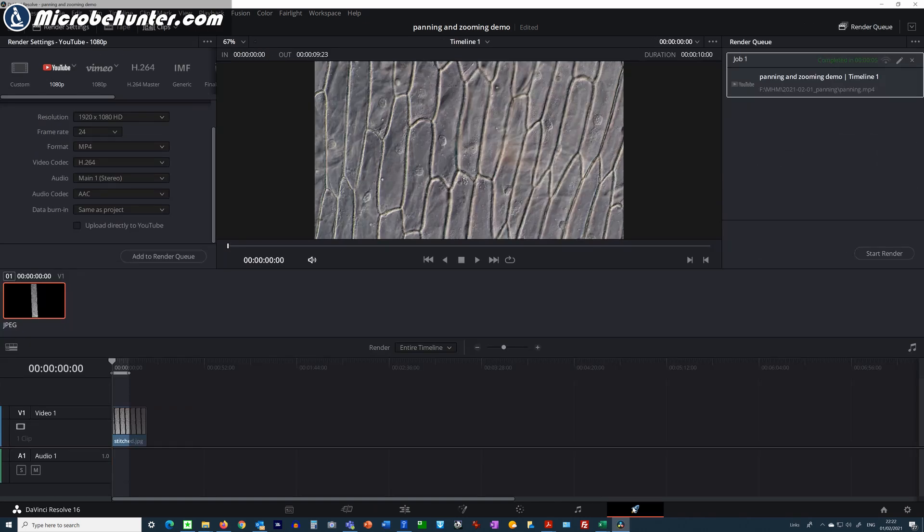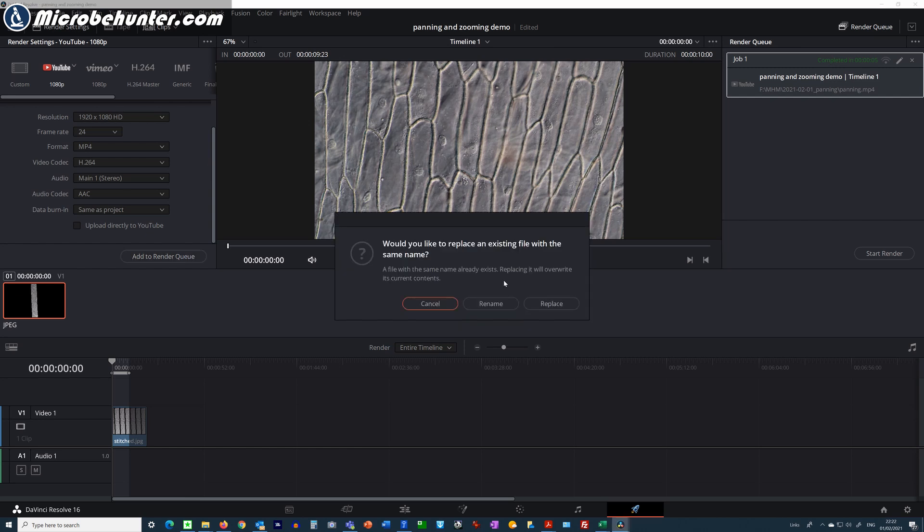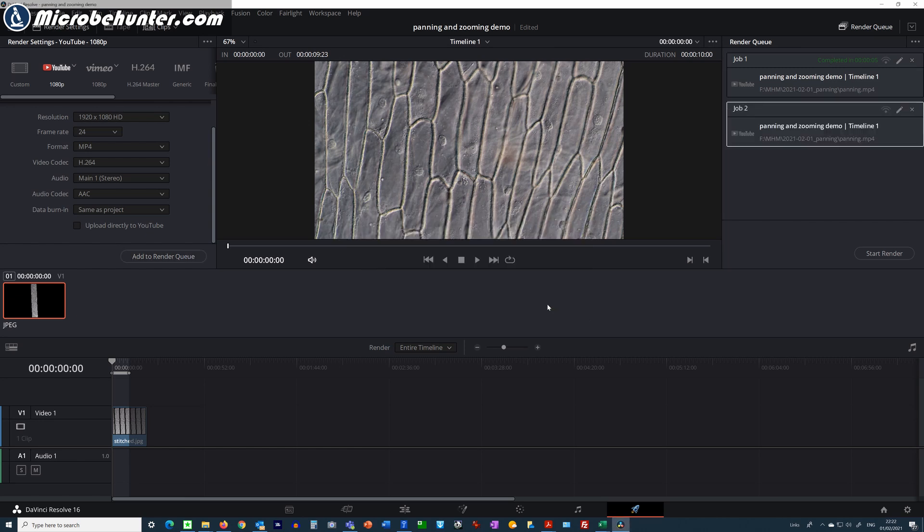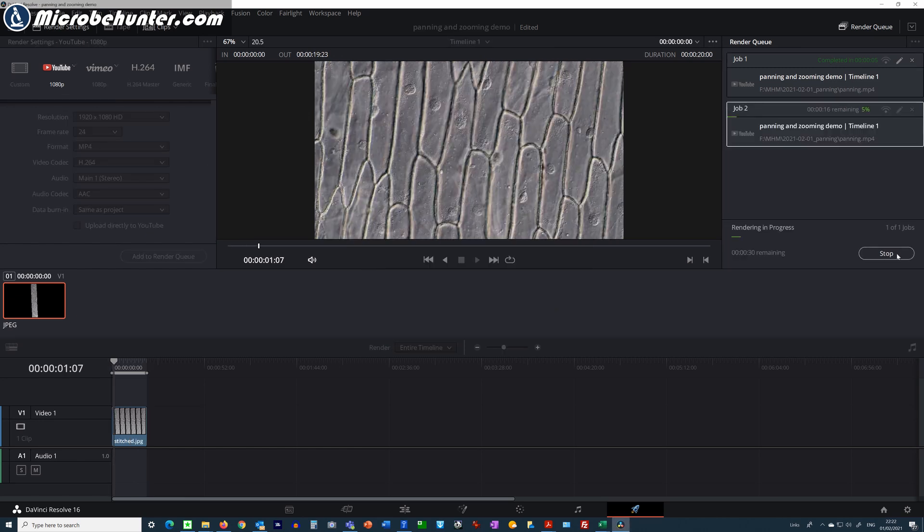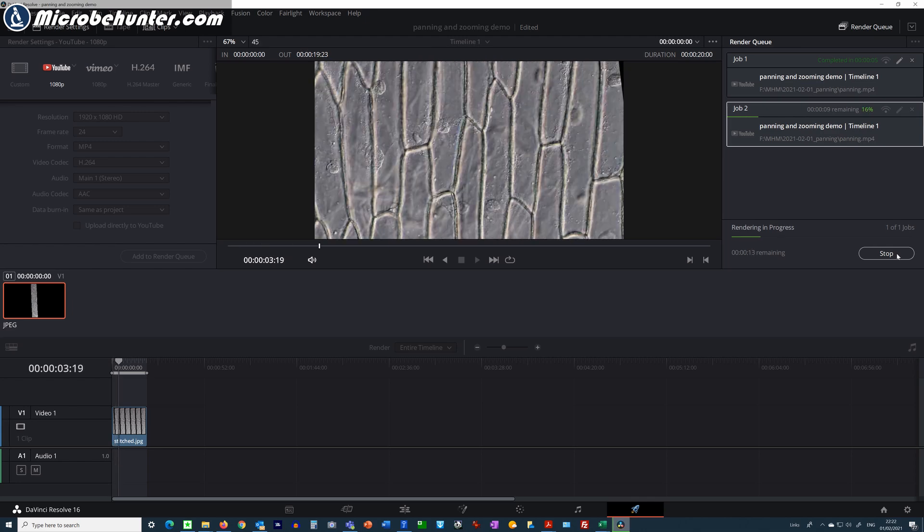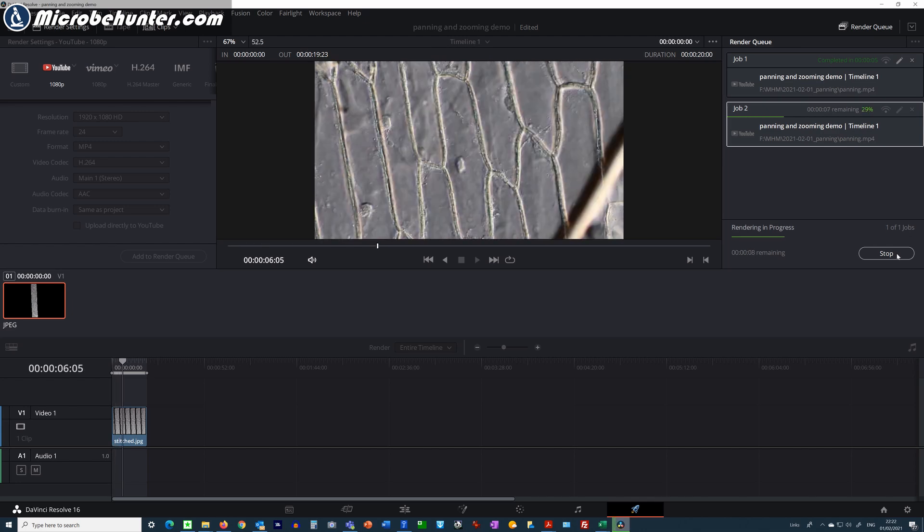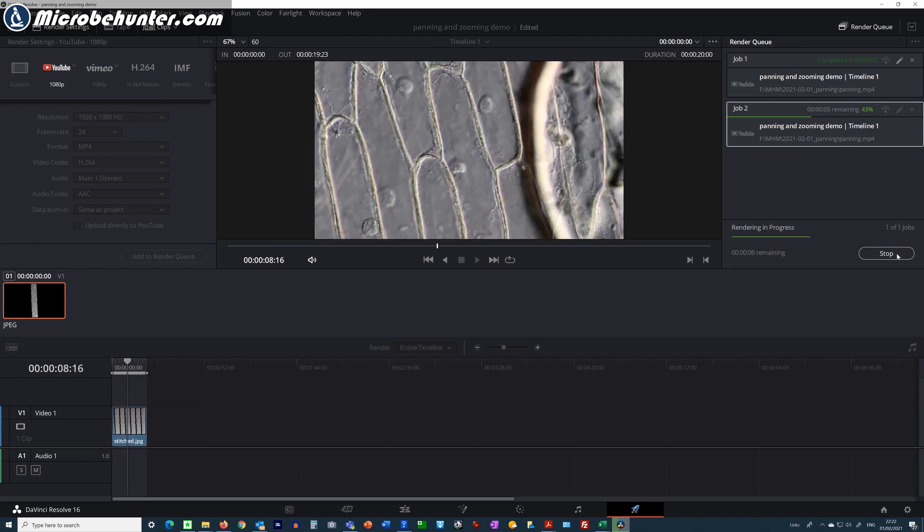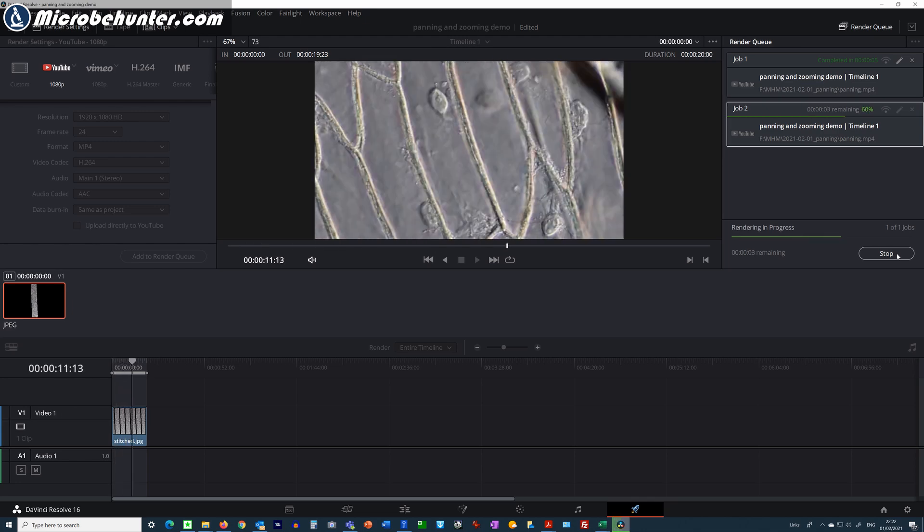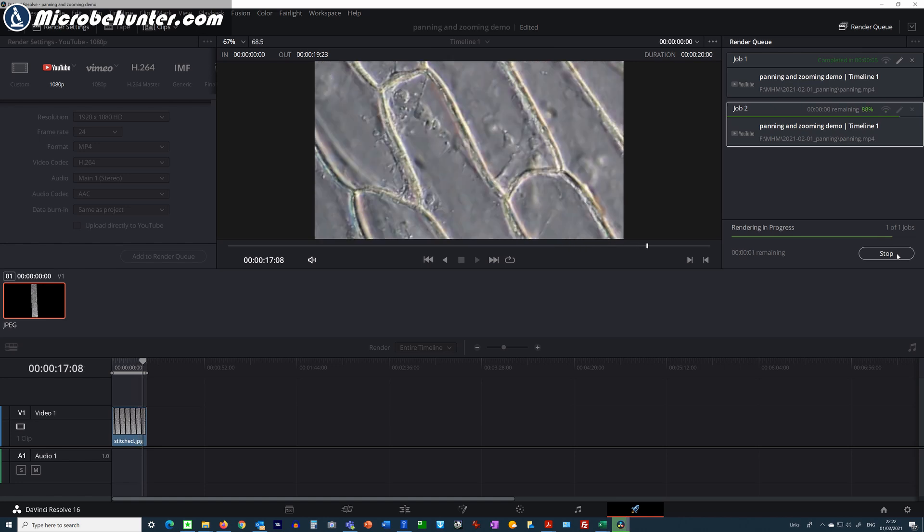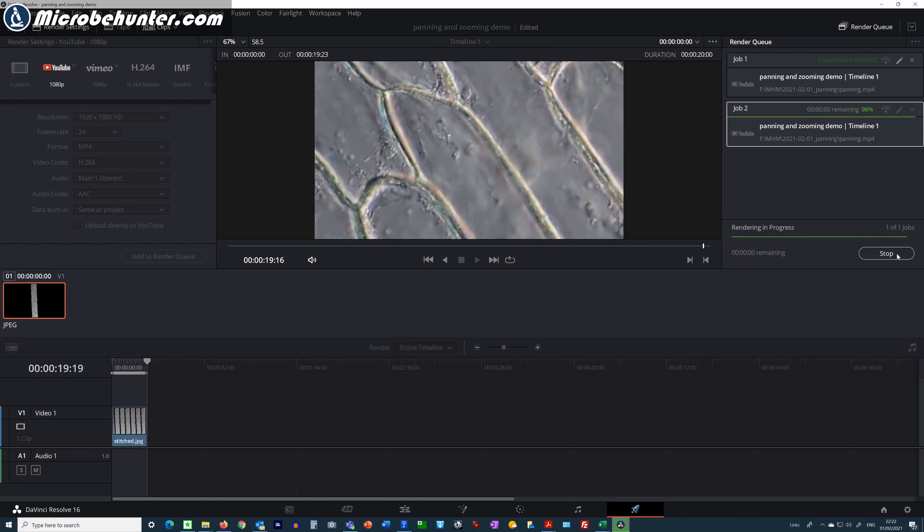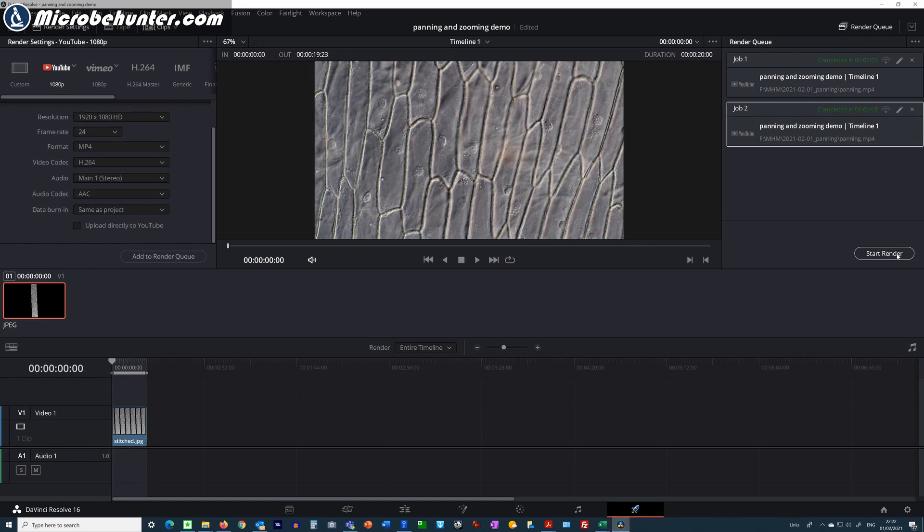These are of course effects that you cannot do just using your microscope alone because of course you do not have a continuous zoom in a microscope. This can really make also static images that you've taken with a microscope appear very interesting and maybe more engaging. So let's have a look how this looks like.